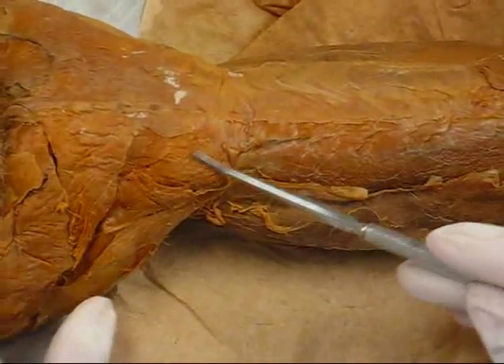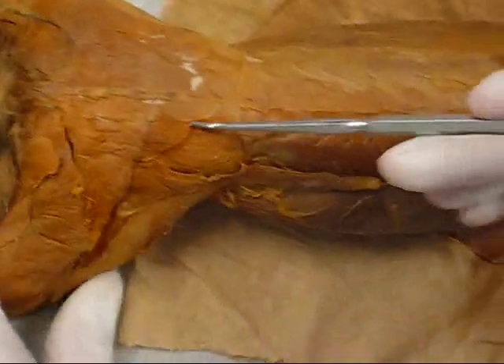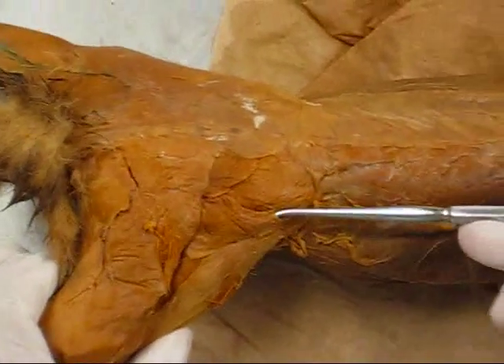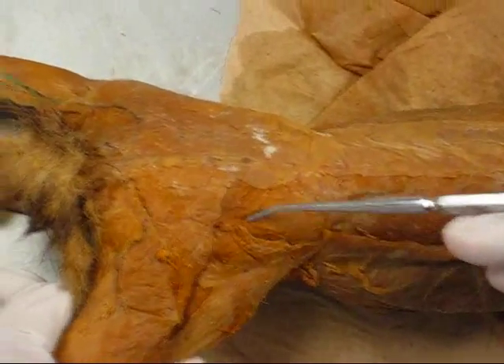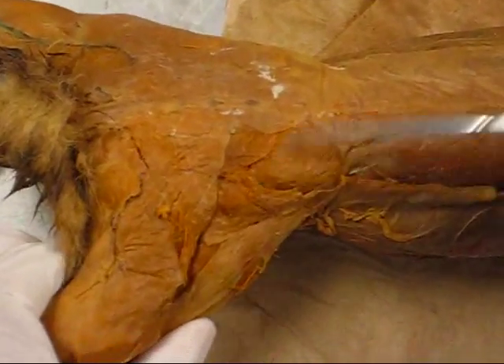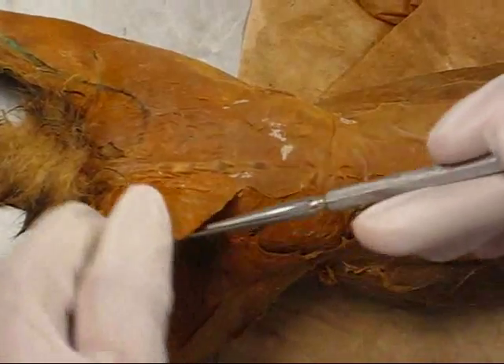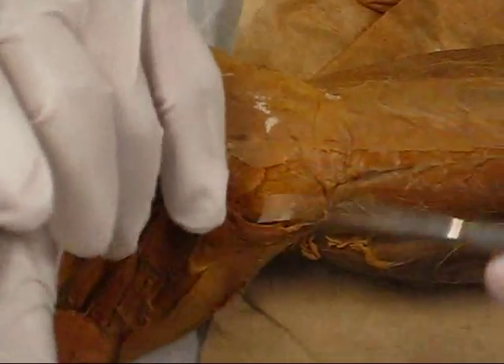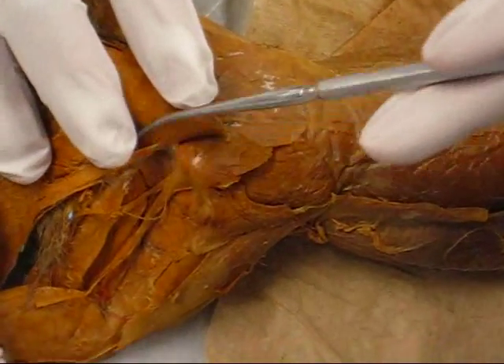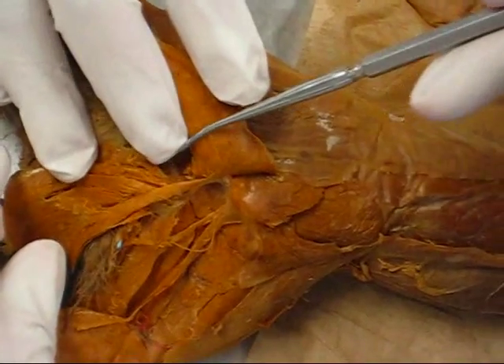Gluteus medius, gluteus maximus. The caudal femoralis. Biceps femoris.